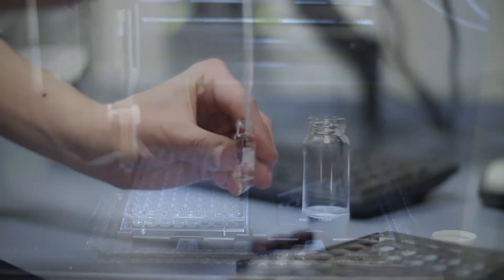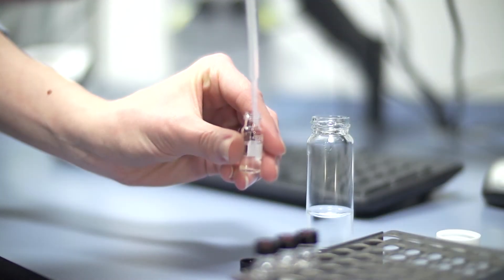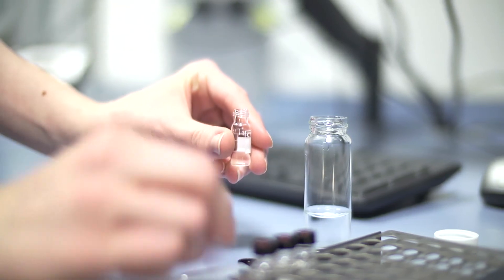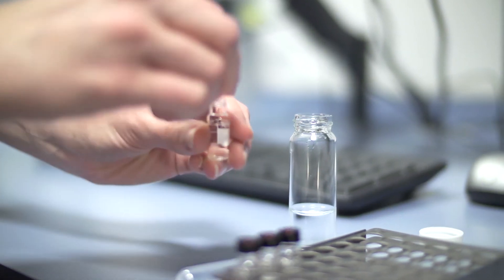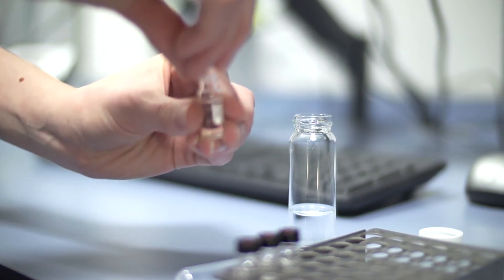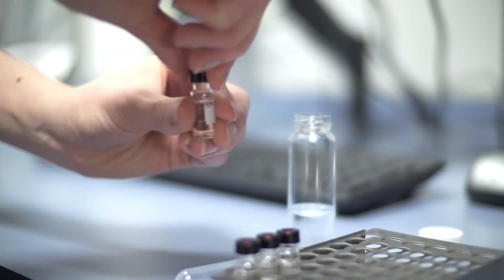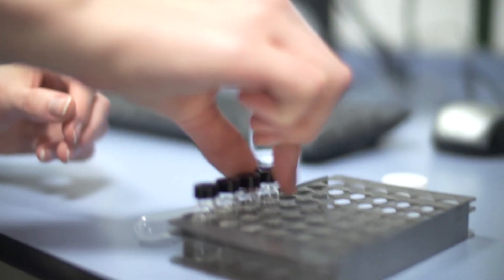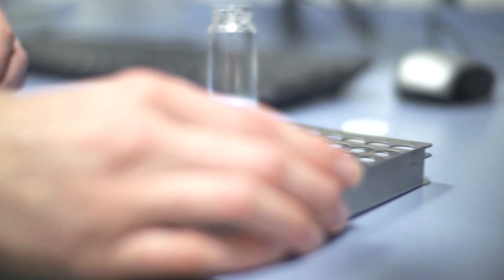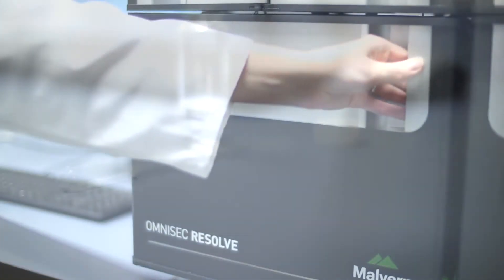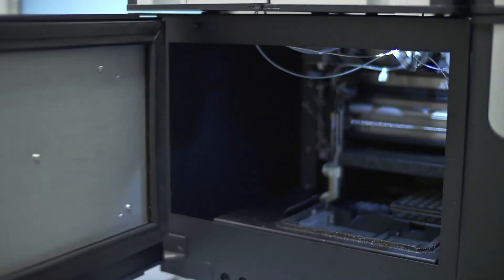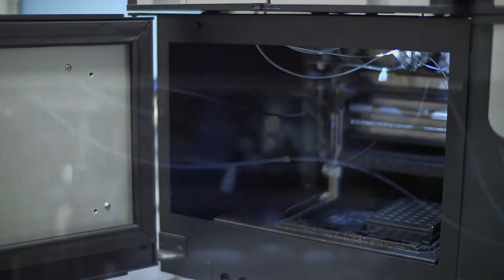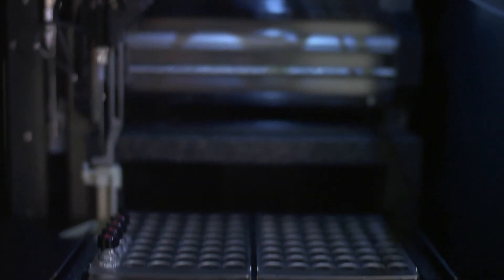The same sensitivity means it's also possible to fully characterize even the smallest amounts of aggregates within a sample. Finally, the auto sampler is cooled down to 4 degrees to prevent aggregation occurring while the sample is waiting to be injected and measured.